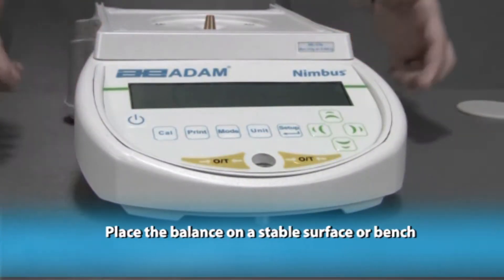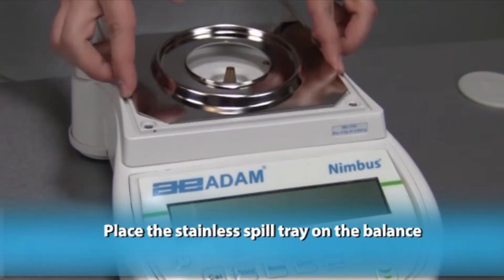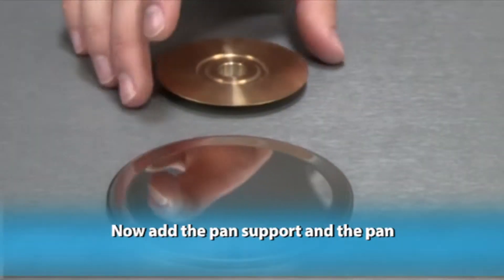Place the balance on a stable surface or bench. Place the stainless spill tray on the balance. Now add the pan support and the pan.